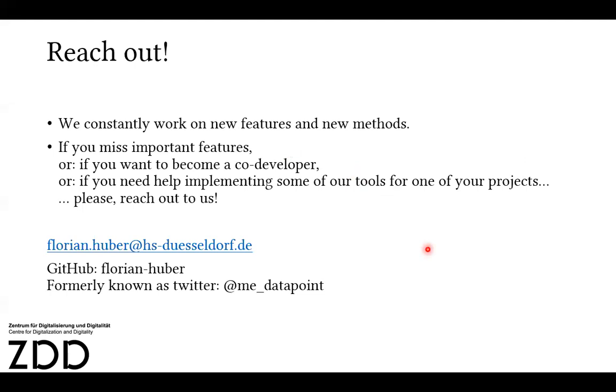If you have any questions, not only on the code of today, but also in general about Python tools, about MS2DeepScore, MS2Query, please reach out to people like me, because we're constantly developing new features and new methods. As I said several times, I'm not a chemist, I'm not the expert on the domain side. I'm trying to adapt machine learning, deep learning and data science methods and Python software development for this community, but I always rely on good collaborations, so we're always interested in hearing from you what you really care about, what kind of things you need or are missing.